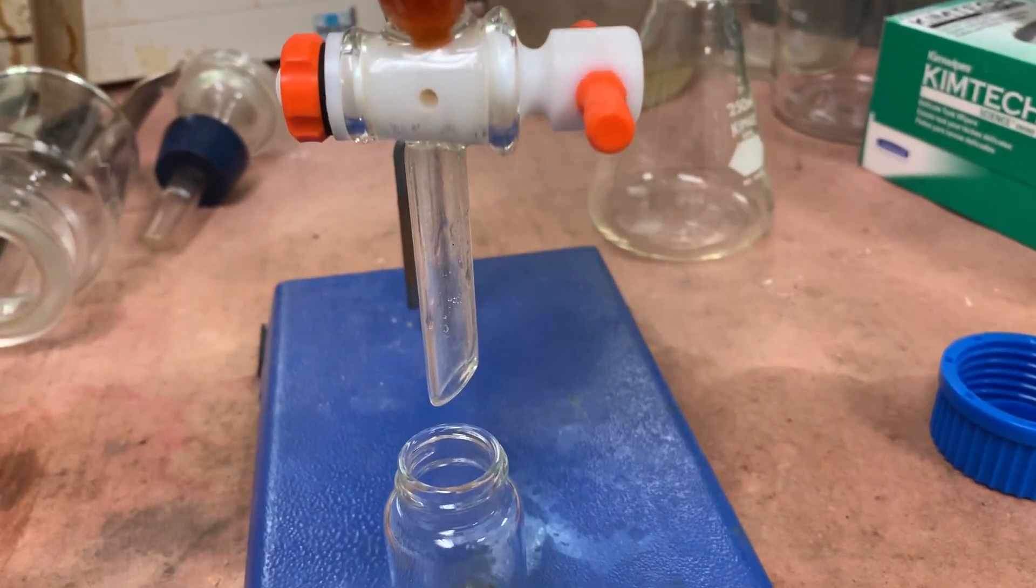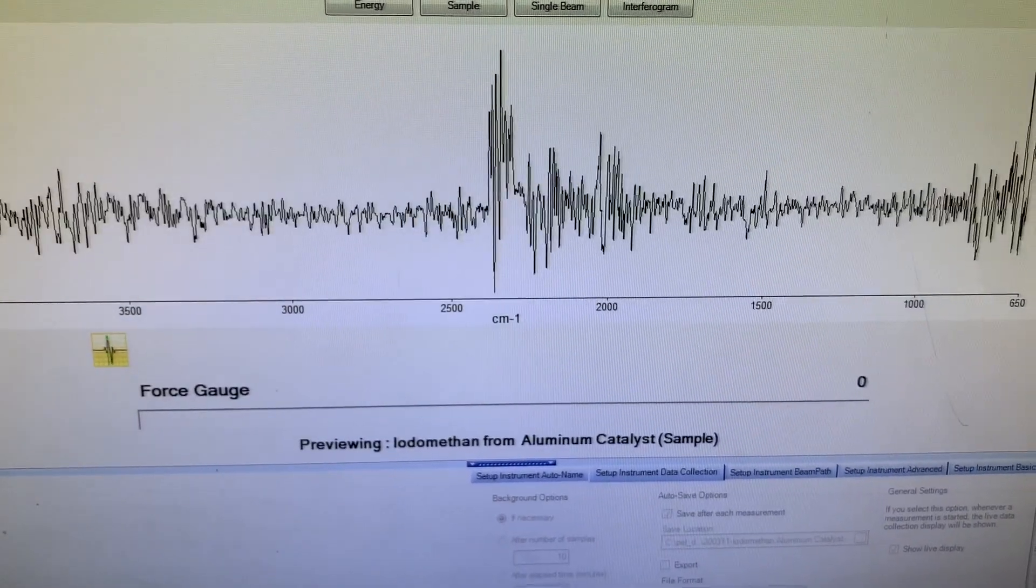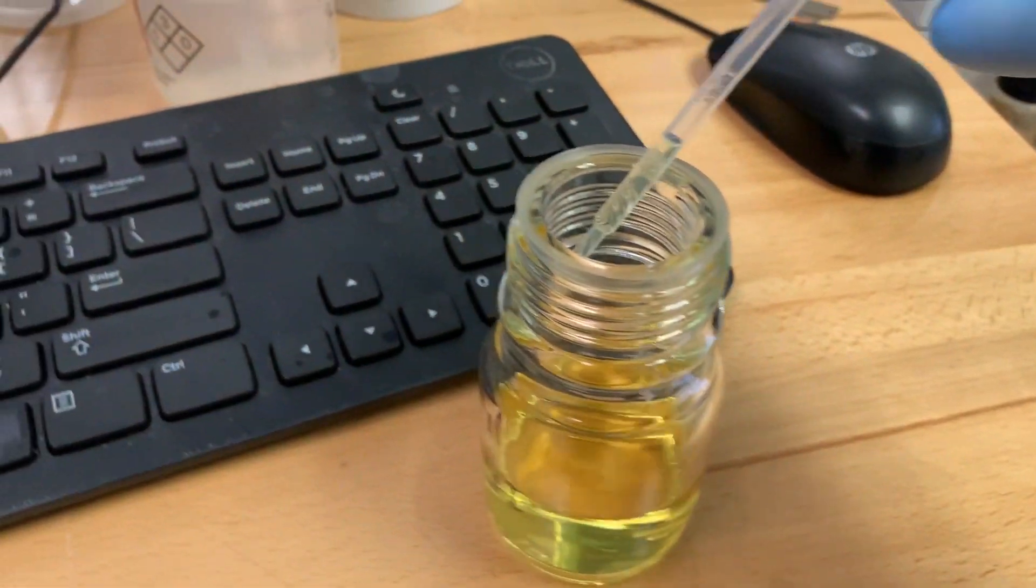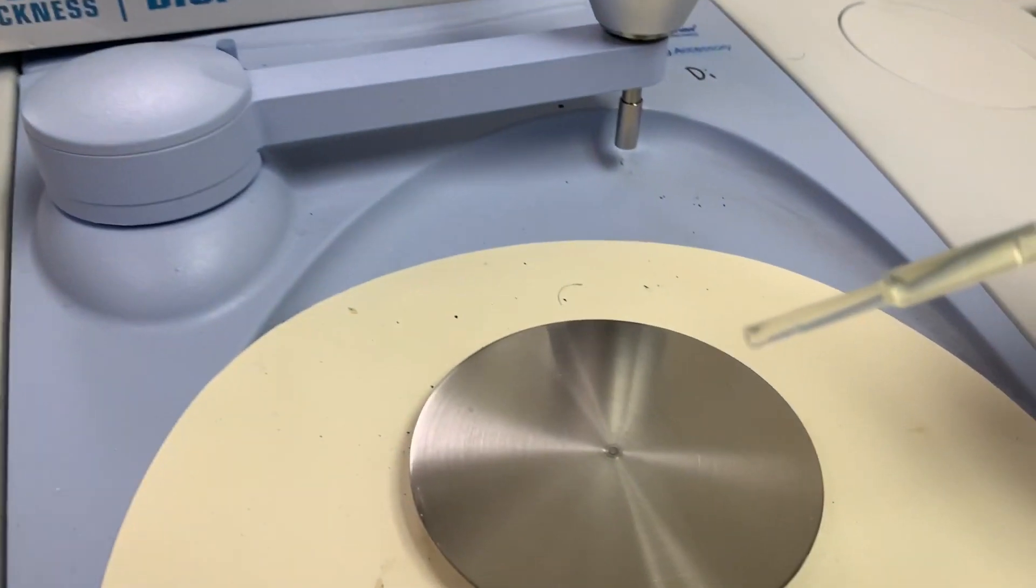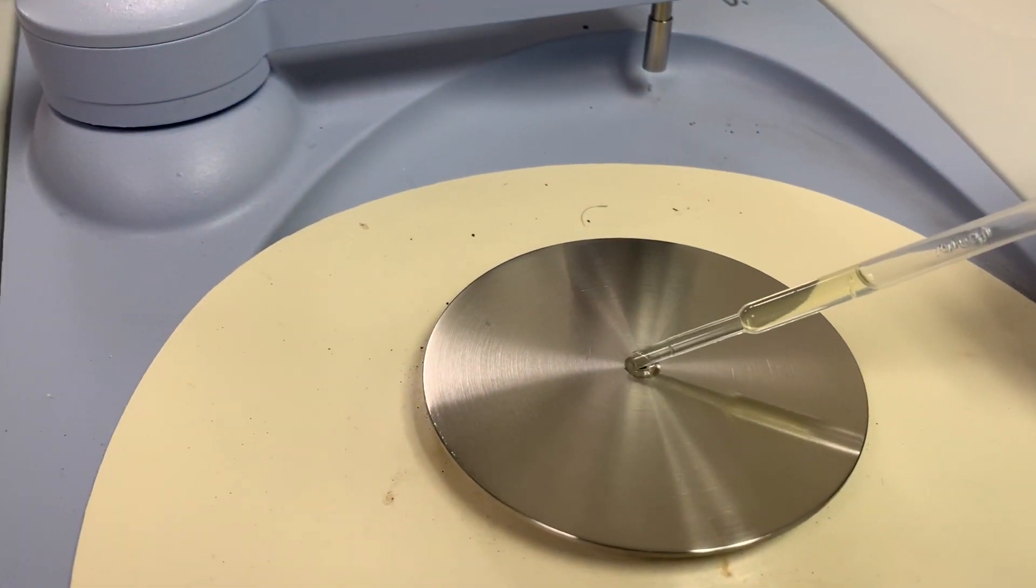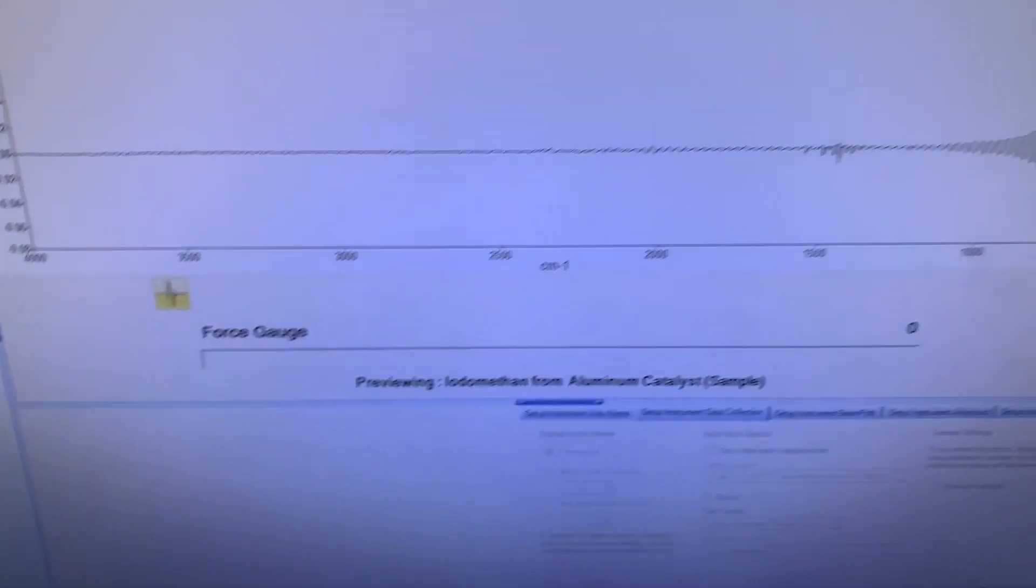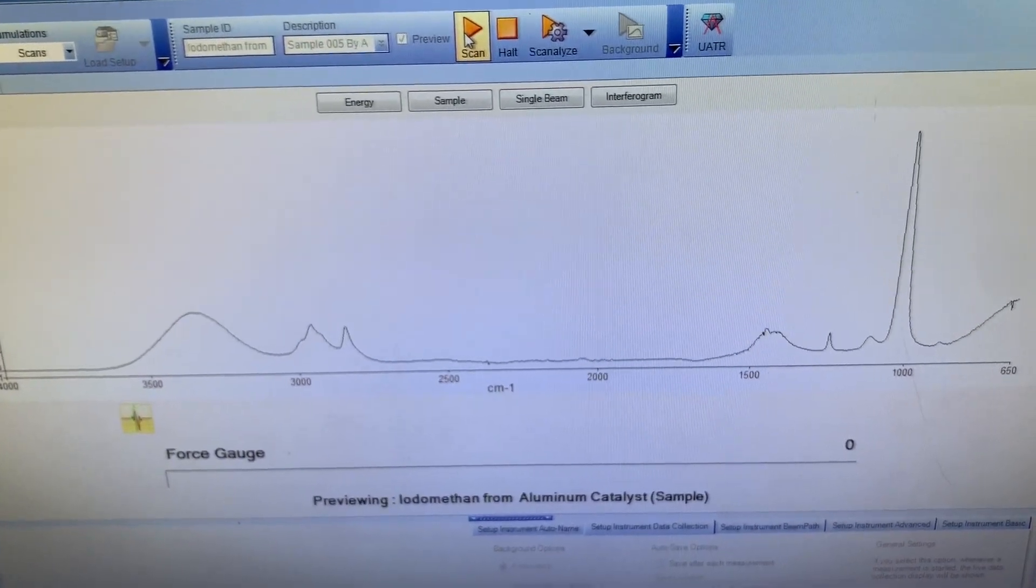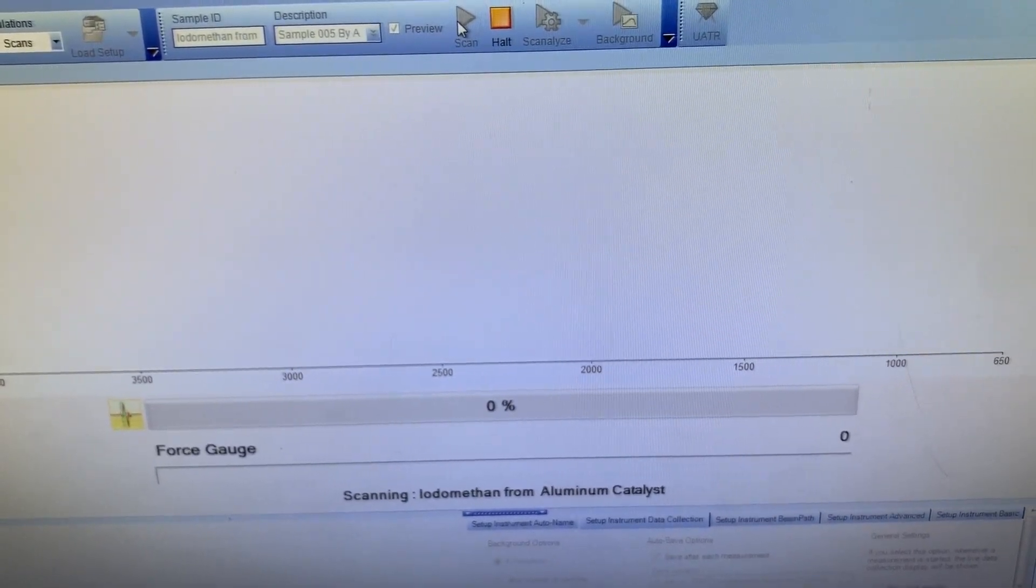I decided I was going to analyze this with FTIR. You take a little bit of your sample and place it on the little circle there, that's a diamond crystal that's reflecting the FTIR beam. It goes through your sample and you get a spectrum. It's a very simple analysis but very effective for a lot of organic materials to get a fingerprint that you can search against the database.